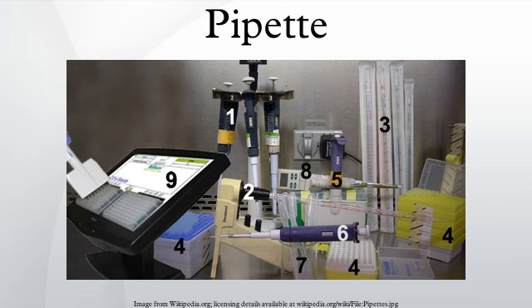Ostwald-Folin pipette, a special pipette used in measuring viscous fluids such as whole blood. Common in medical technology laboratory setups together with other pipettes. Invented by Friedrich Wilhelm Ostwald, a Baltic German chemist, and later refined by Otto Folin, an American chemist.